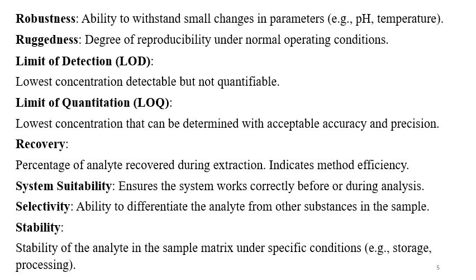Then system suitability. System suitability means the system works correctly, and it ensures the system works correctly before or during analysis. If you are working on some system like HPLC, then a system suitability test should be there.